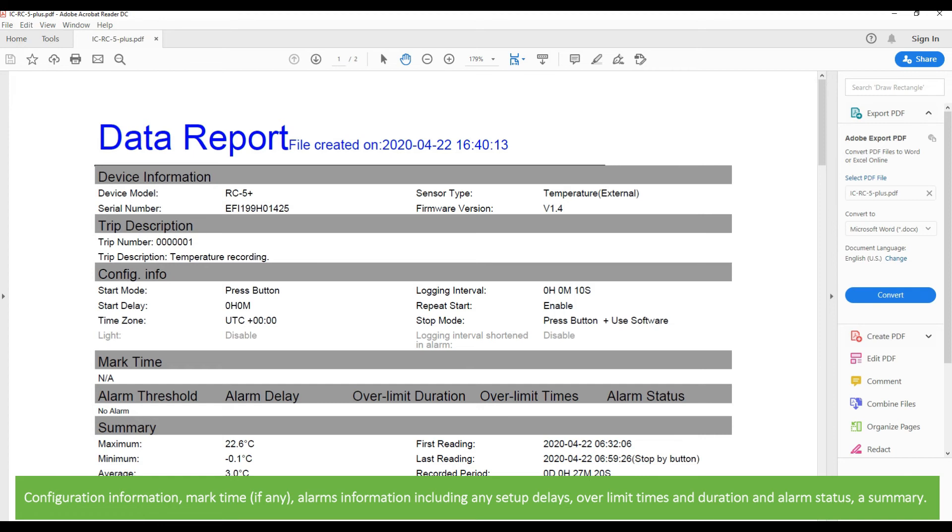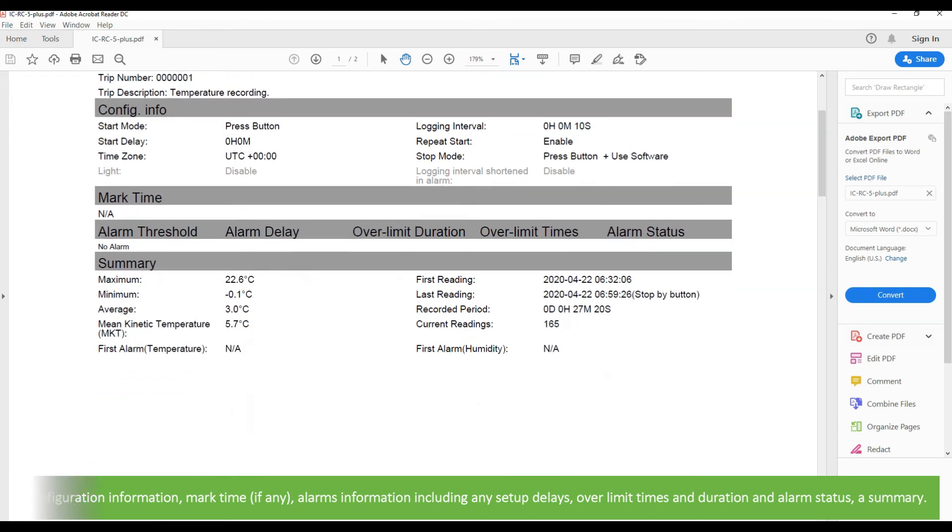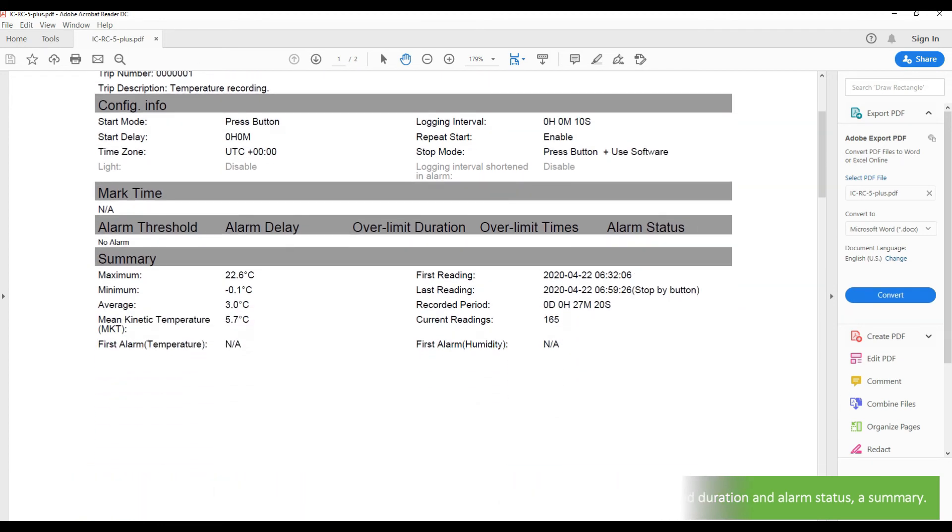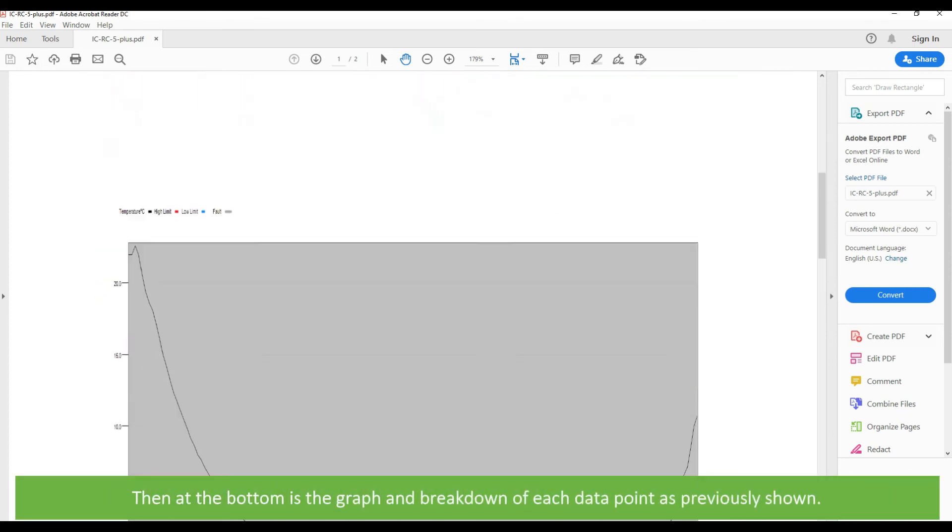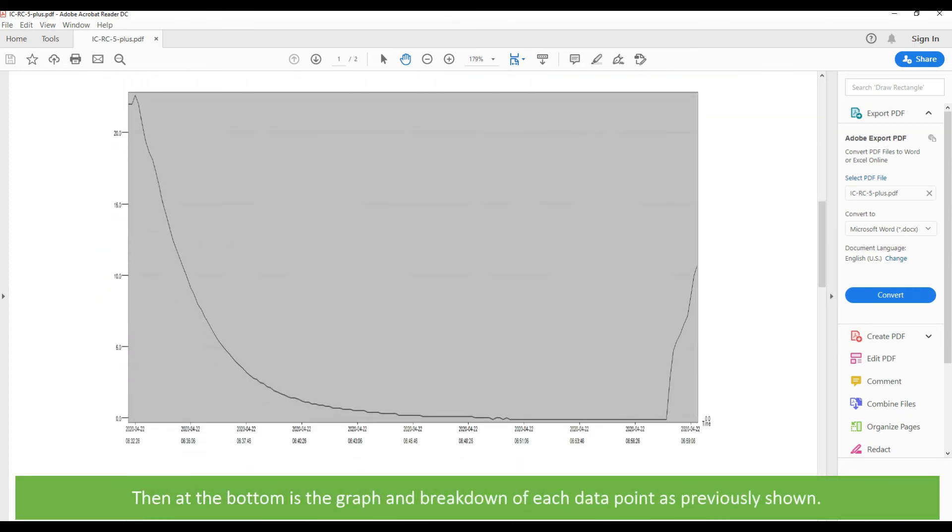It also shows over limit times, duration, alarm status, and lastly a summary. At the bottom is a graph and breakdown of each data point as previously shown.